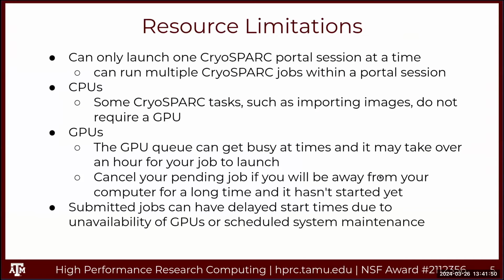All right, so you can only launch one CryoSPARC portal session at a time, but within your CryoSPARC session, you can run multiple jobs, multiple processes, and we'll see that later in the tutorial section. There are some tasks such as importing images that don't require GPU. So if all the GPUs are tied up with other jobs and you want to import some images, you can just launch a CPU only job.